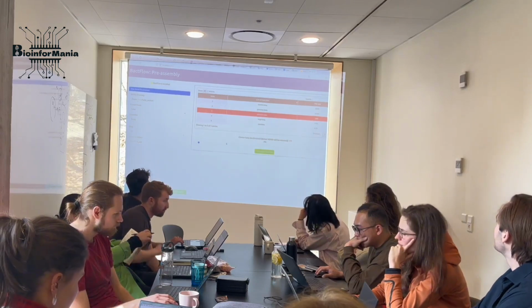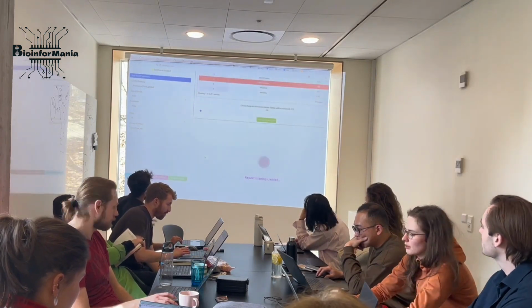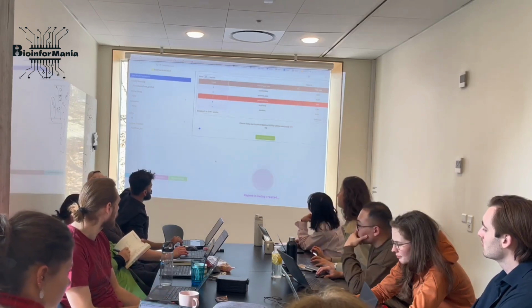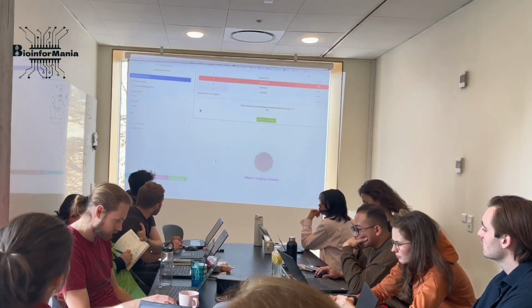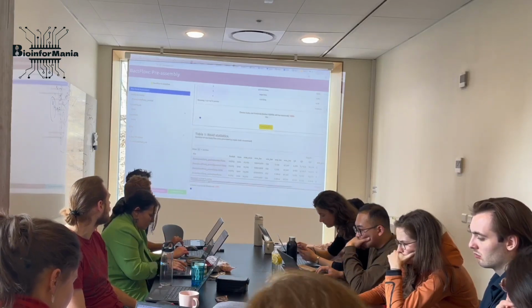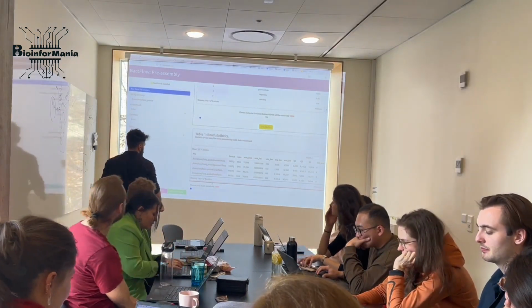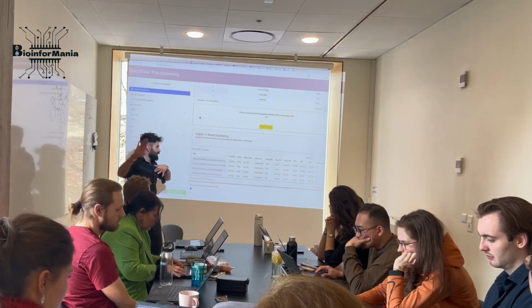And then we display the read statistics. The read statistics will be displayed based on the remaining 4 genomes, okay? Here we go. These are the statistics of your reads. This is very good to understand how to filter your reads later on in the assembly part.